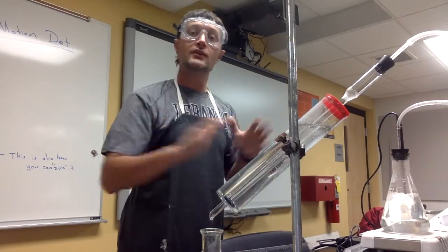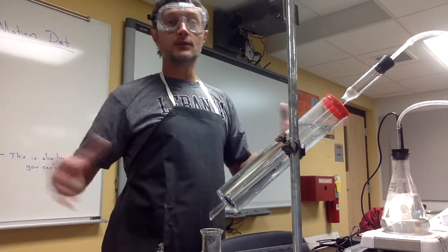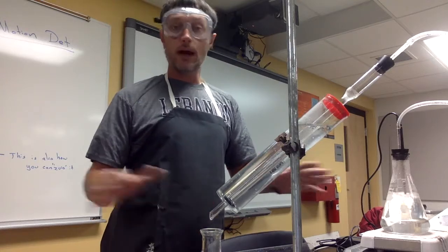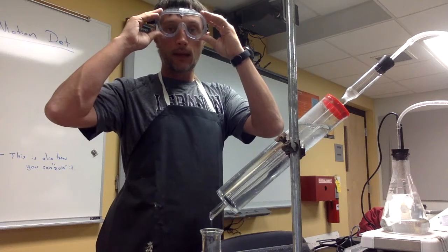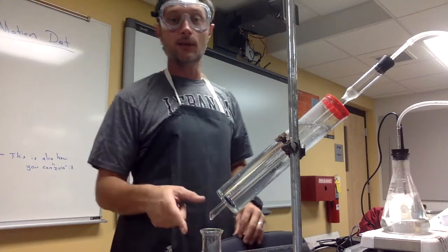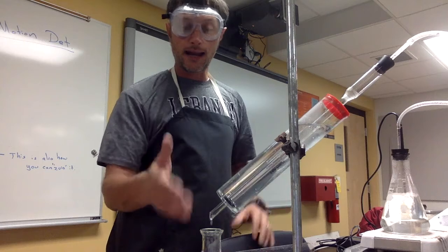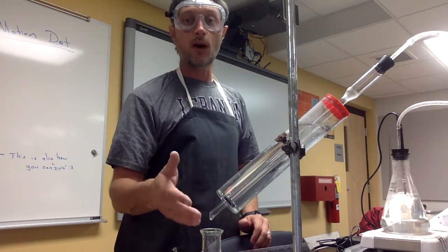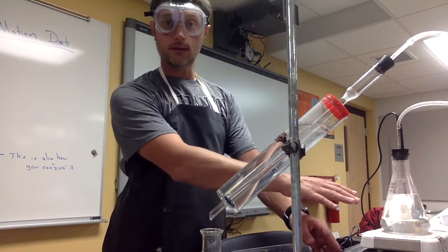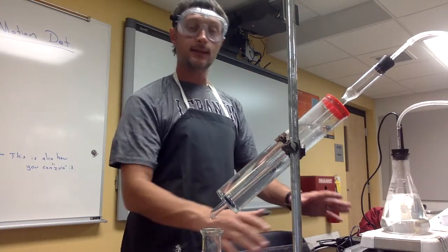Now, interestingly enough, once I get them separated, I should be able to do some things to identify them. One of these substances will be water. The other one will not be water. The other one is the contaminant. And it's impressive to me, just standing here, I can smell the contaminant. I couldn't smell it when it was mixed together, but when it is separated, I now can smell the fumes that are coming off of this liquid. You can kind of see the bubbling is slowing down. I'm trying to make sure that it stays the same.